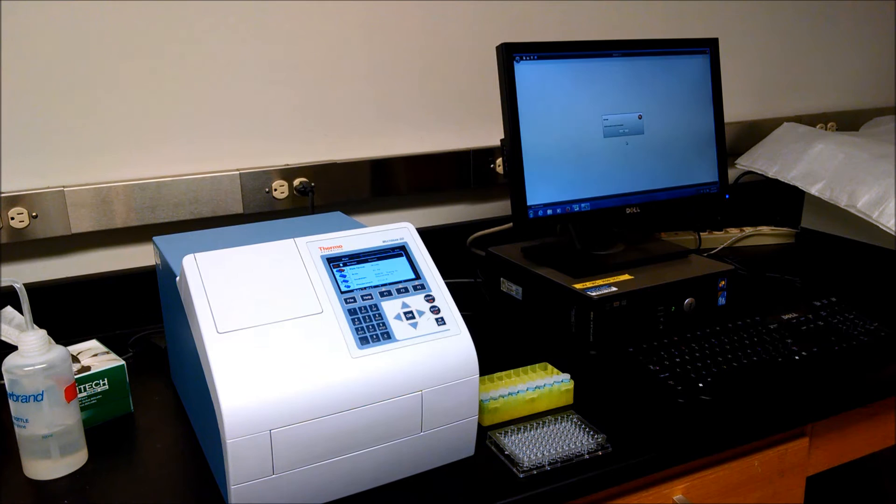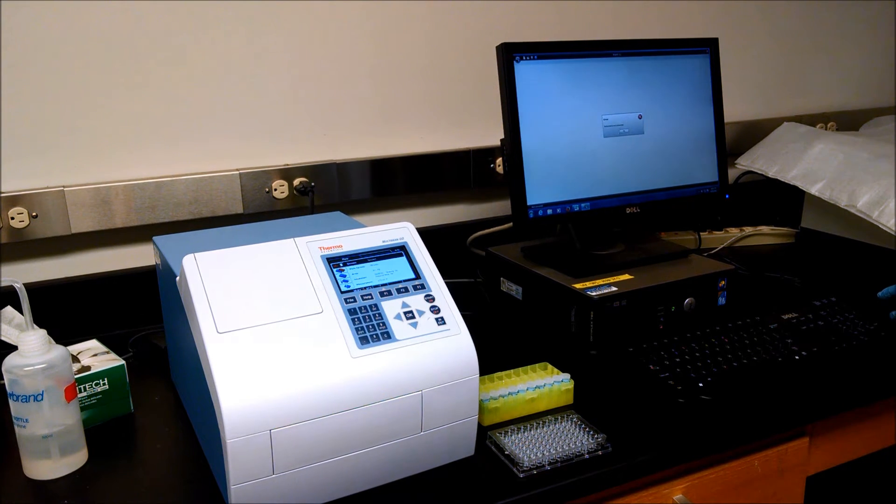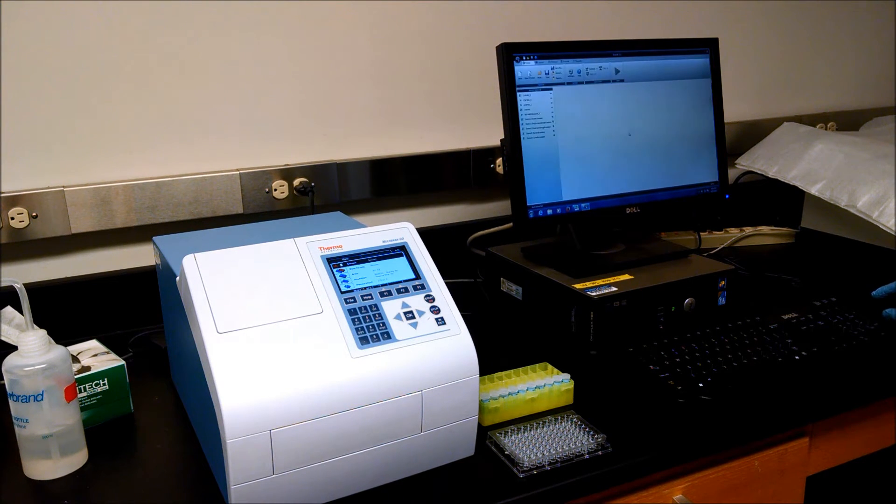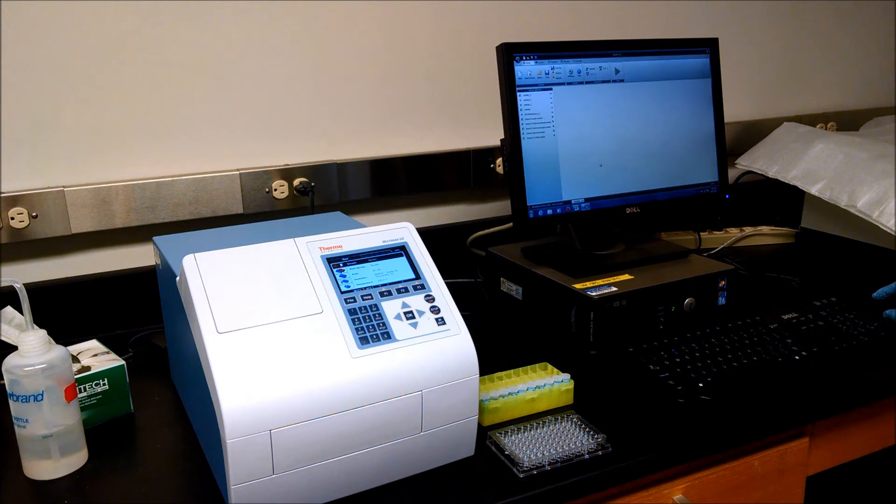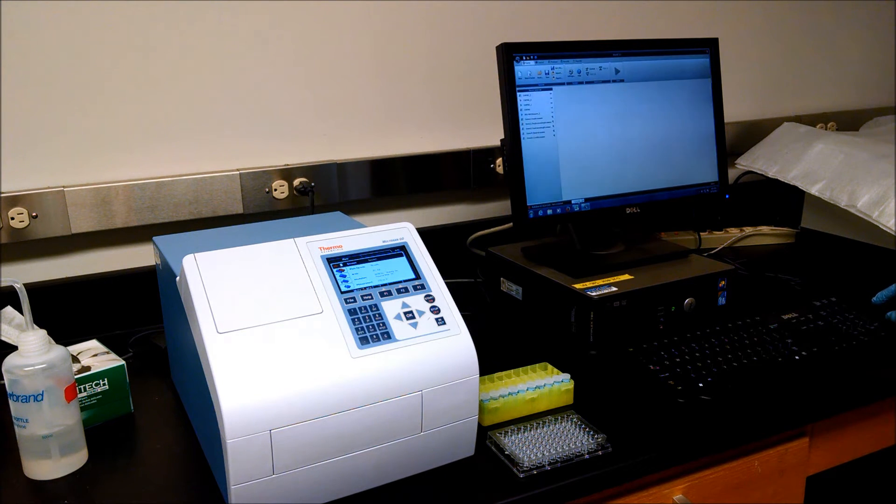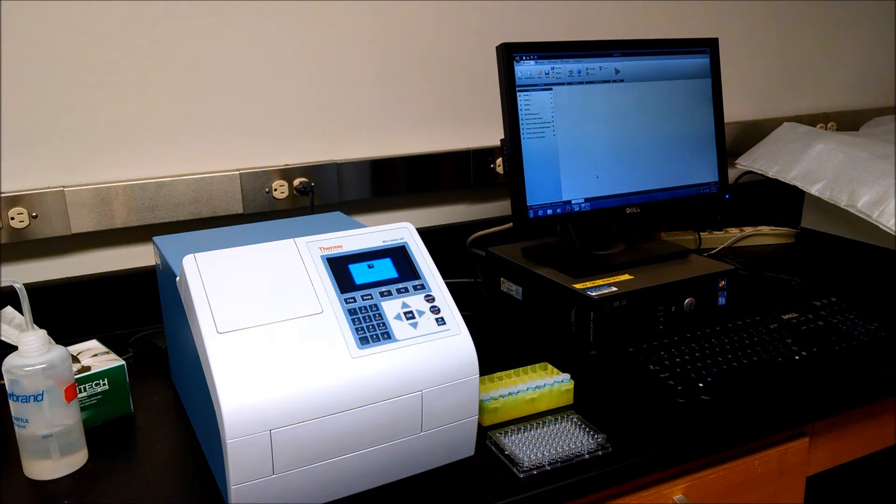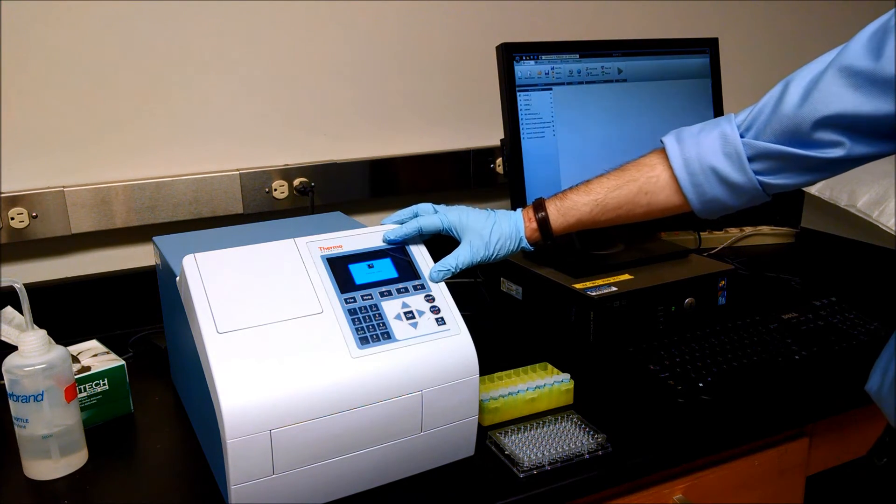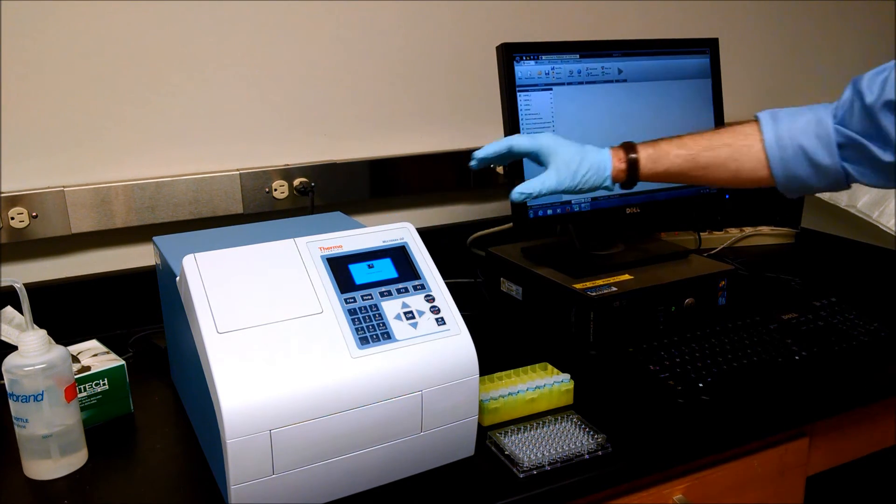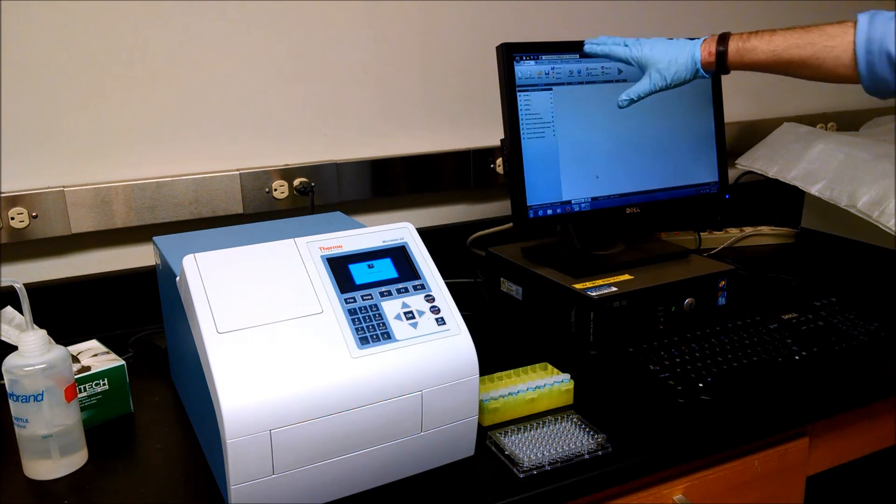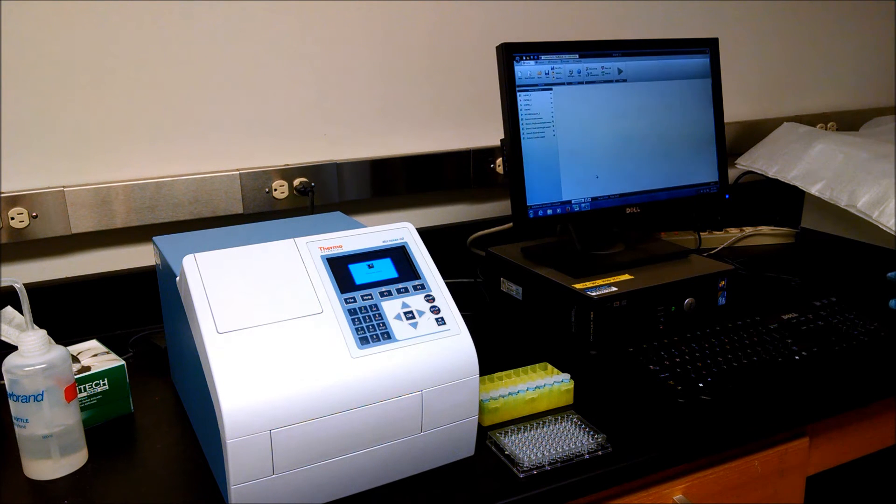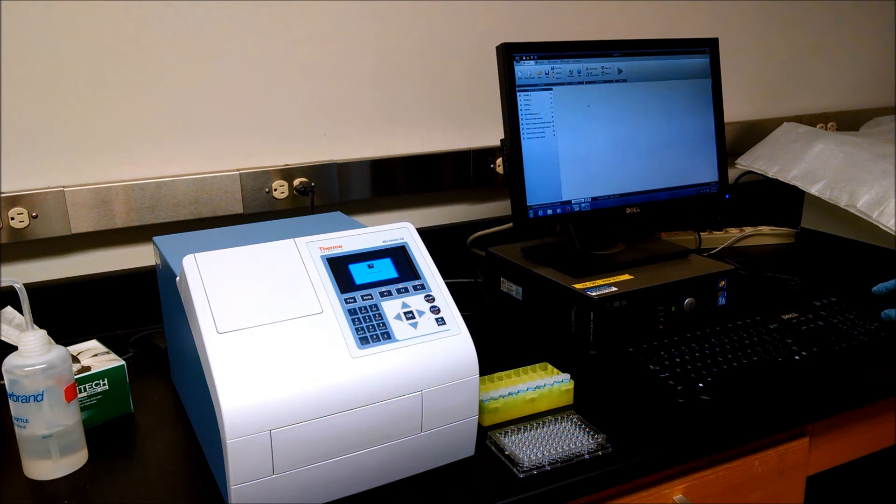Now that the instrument is ready, we can try to connect again here. Once it's connected, the window on the instrument says computer control, and up here we have all the controls that we need.